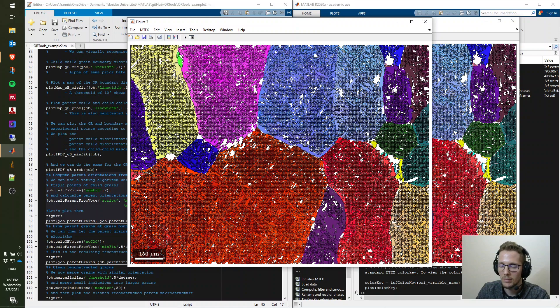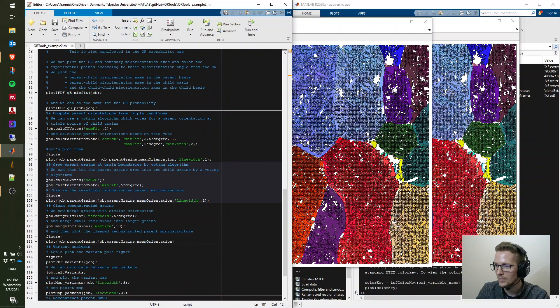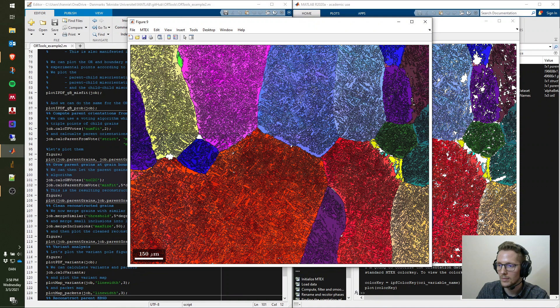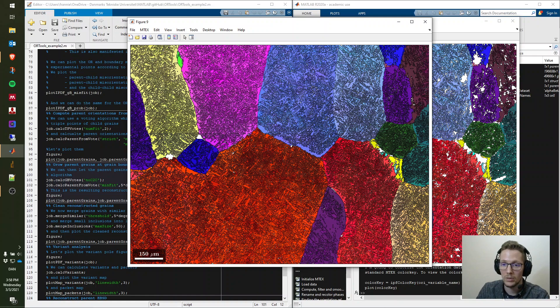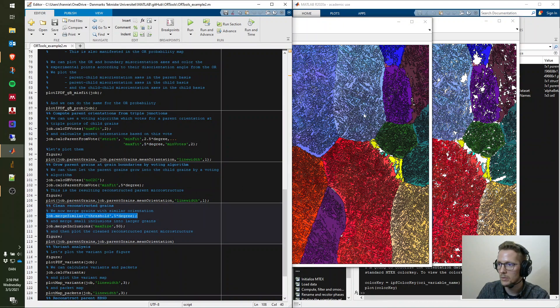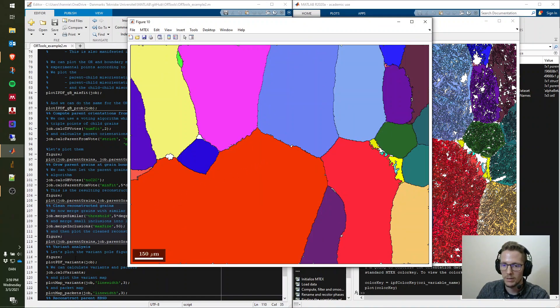After running the correct block (a wrong block was run initially), we get the improved result. Almost no areas remain without a solution. There's one ambiguous artifact area where I wouldn't be too confident, but overall the reconstruction is very satisfying. We then clean the reconstructed grains by merging similar orientations and incorporating small inclusions into the parent grains to clean up the microstructure, yielding a nicely reconstructed result.